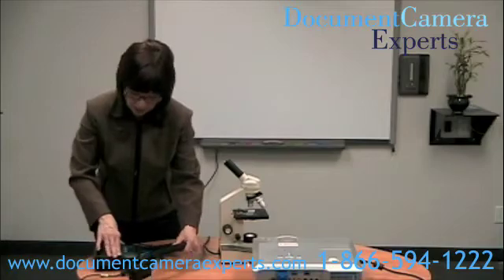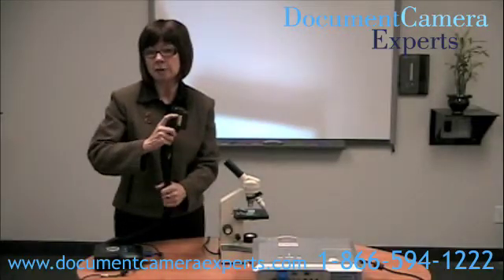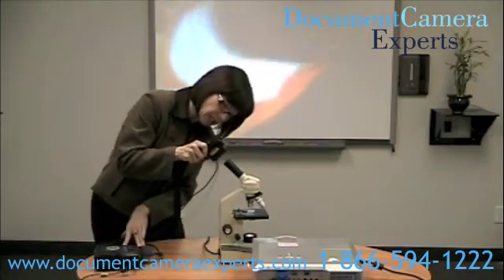I'm going to raise the arm of the CP300. We're doing this without an adapter, although you can buy a microscope adapter and there is a training video available for that as well. So I'm going to fit this down over the lens.